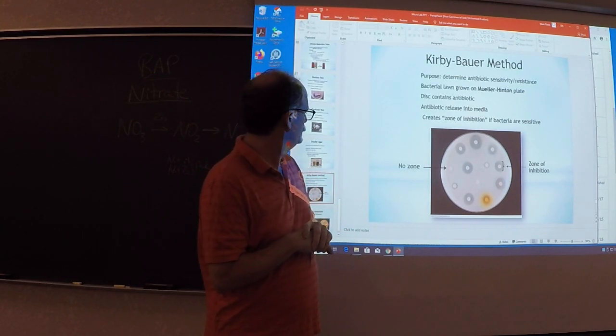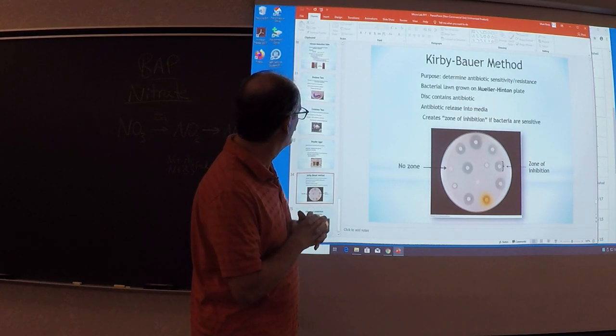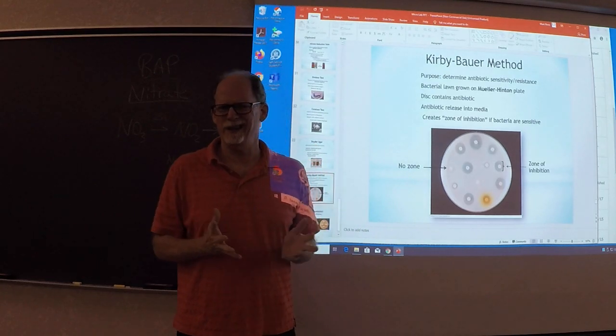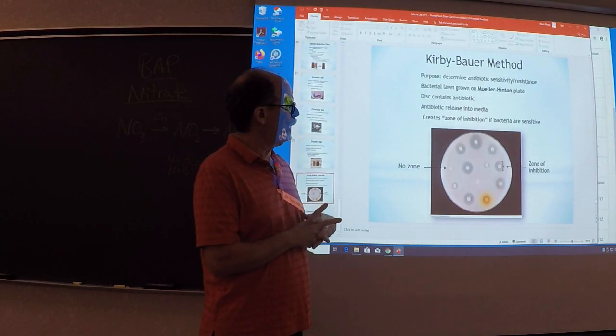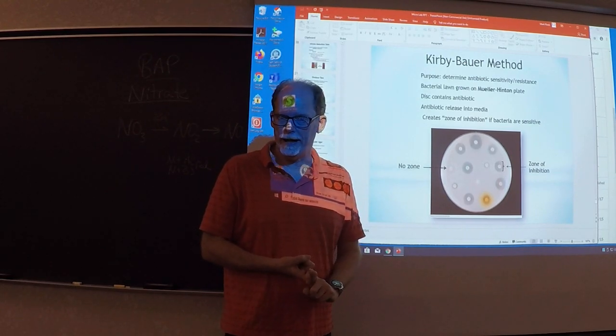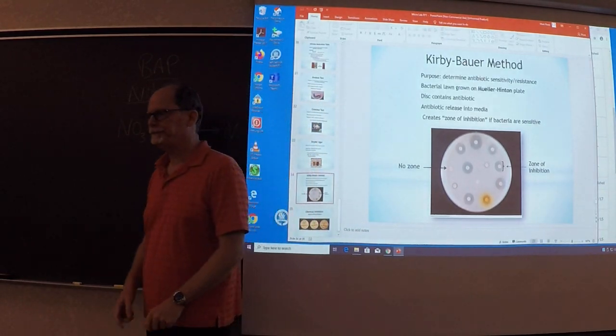So it's a pretty straightforward explanation, I think. What causes the zone of inhibition? The antibiotic does.